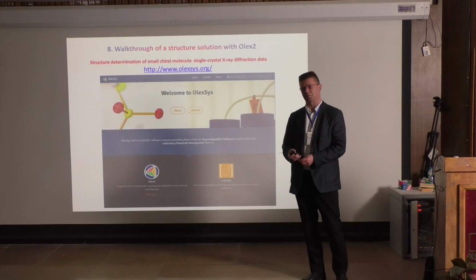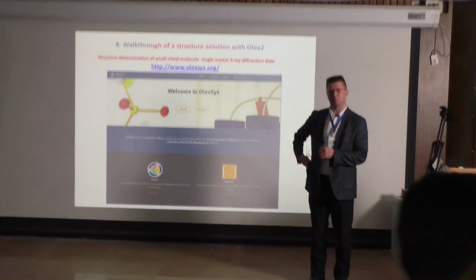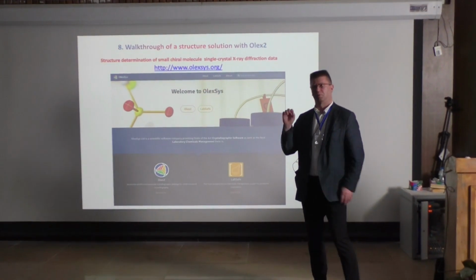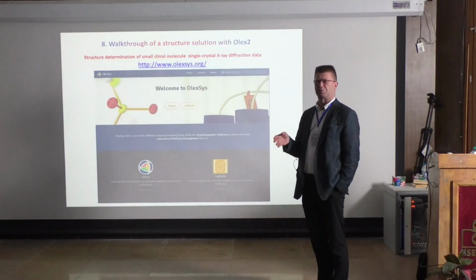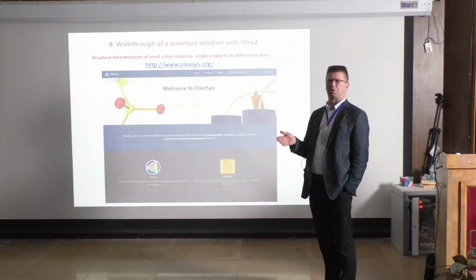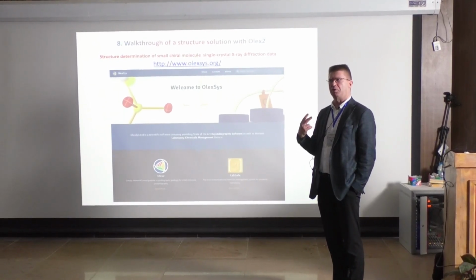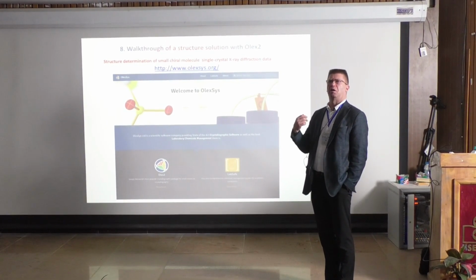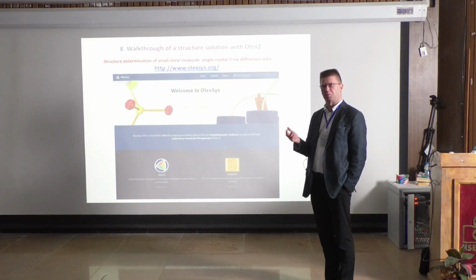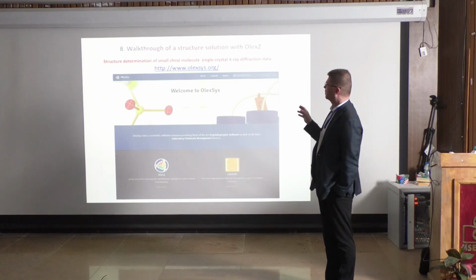So now we have done the theory, we know what the X-rays are. We know that we need the instrument. This is the diffractometer, which is using X-rays, and we have to now record all the reflections coming from the crystal. And these crystals then appear as numbers from the instrument. And now we are really taking in the instrument data and start to look at what the structure is, where this diffraction comes from. And now our target is to use the data.